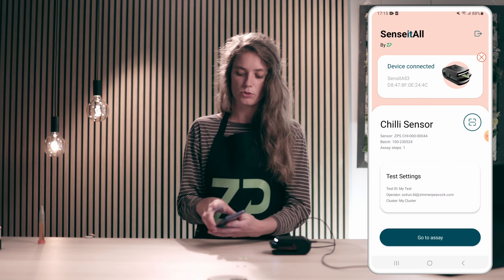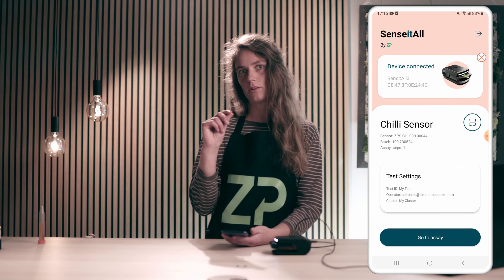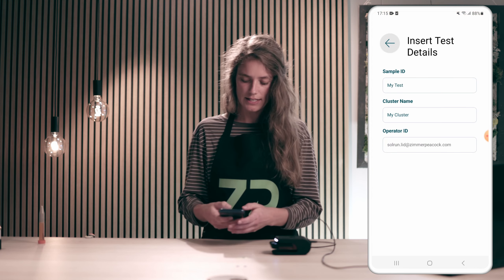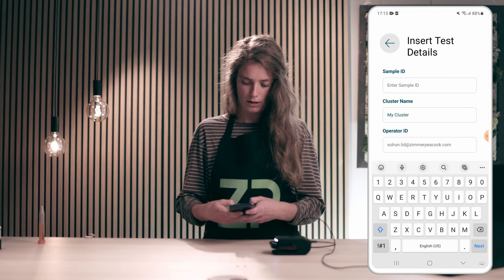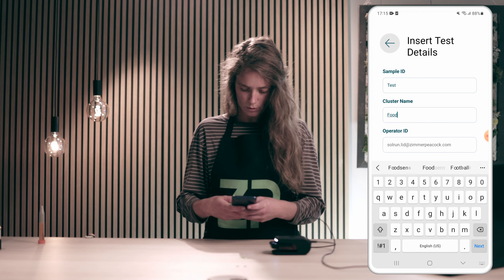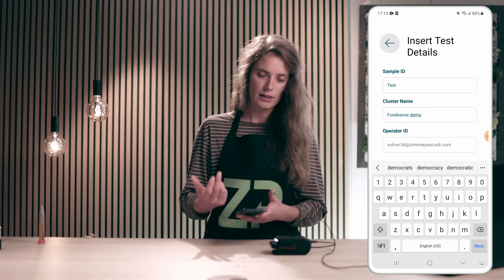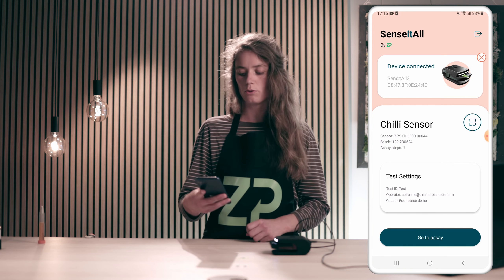The next thing I will do is change the test settings. The test settings are what is labeled on the report — the Juvee report that we will later upload. I will click test settings and change the sample ID to 'test', the cluster name to 'FoodSenseDemo', and the operator ID is my Juvee account email. Then I will go to assay.